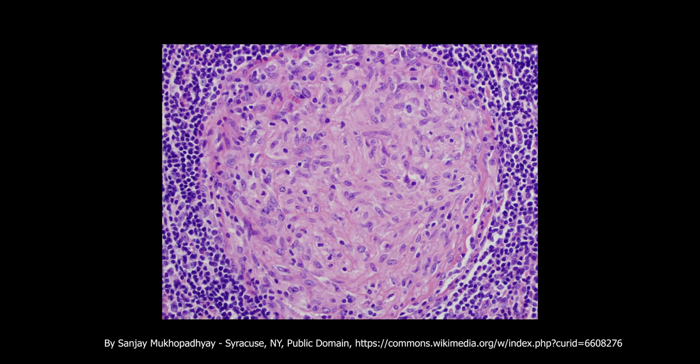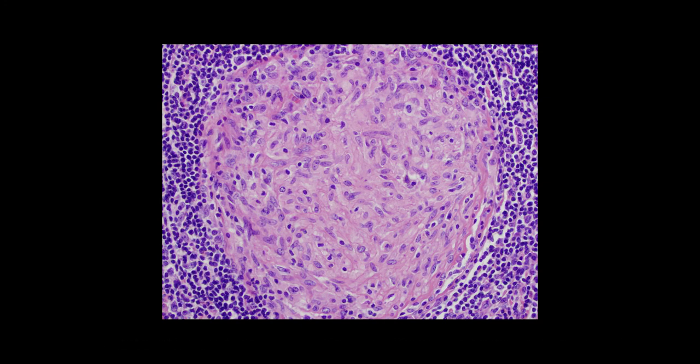Here's a classic H&E picture of a granuloma. You can see there's a lot of chronic inflammation around the outside, and then these histiocytes inside there.